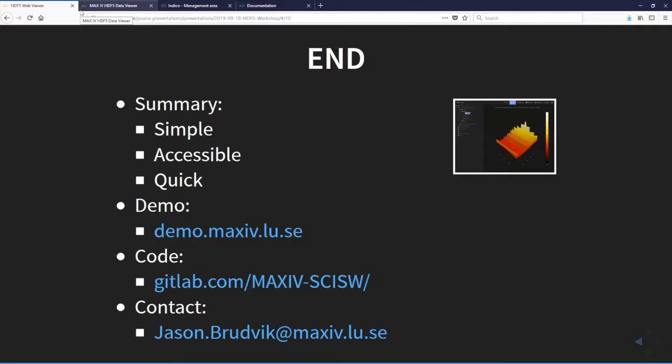So you could display curves if you want, and slice through the 3D data to choose what you want to display. Or you could do the same with images, and then you can change the way you go through the data. And of course, you can see the raw data as an array if you want. And that's another dataset.